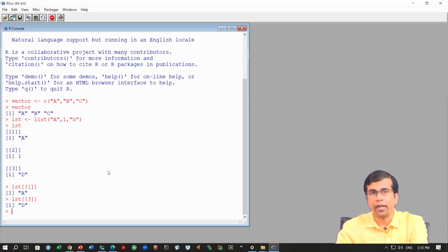You can also define matrices in R. This is the type of data that we will encounter most. We will work mostly with matrix data because we are talking about count data in transcriptomic data. Raw data means we have genes in the rows and the samples in the columns. So, this will be a matrix, where the dimensions are determined by the number of genes and the number of samples. We will come to that in a moment when you actually start working with the read data.